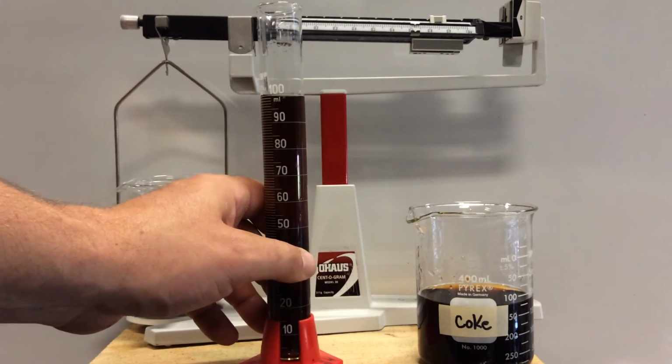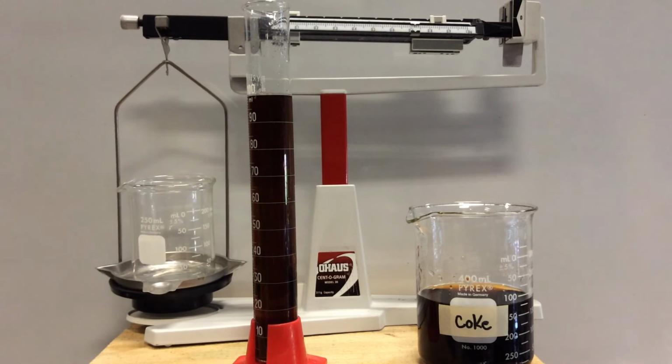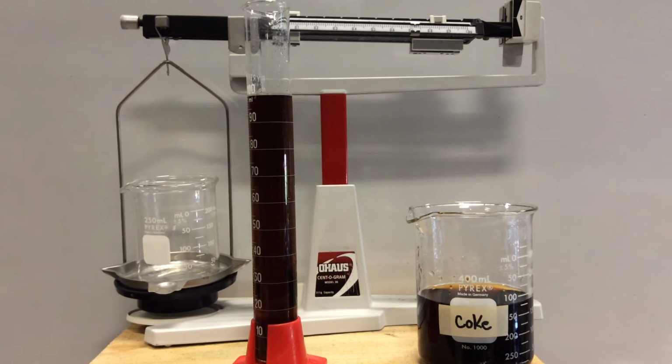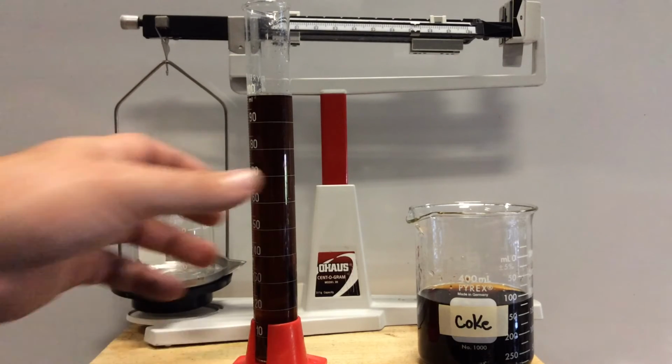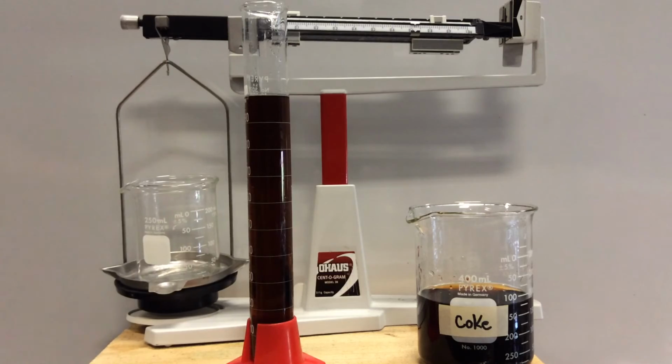that now has a regular Coke in it, and we're going to use the mass of the container that we used for the first one. We cleaned it out, so we can go that route. You may find that to have some error in it as well. So we'll think about that. There's always limitations to measurement and experiments.